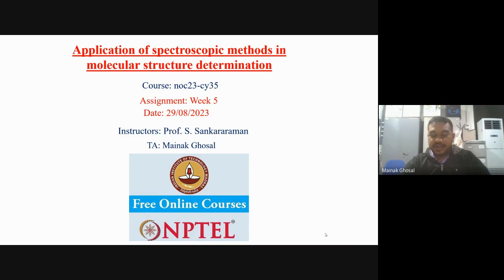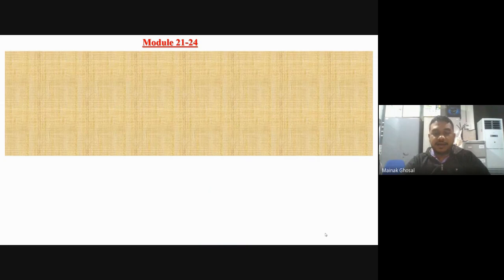These are very new techniques, and they are called ESI and MALDI, that is electrospray ionization and matrix assisted laser desorption ionization. These two are very soft ionization techniques, because they do not produce fragments, and you can measure large molecular weight compounds using ESI and MALDI spectrometry setups.